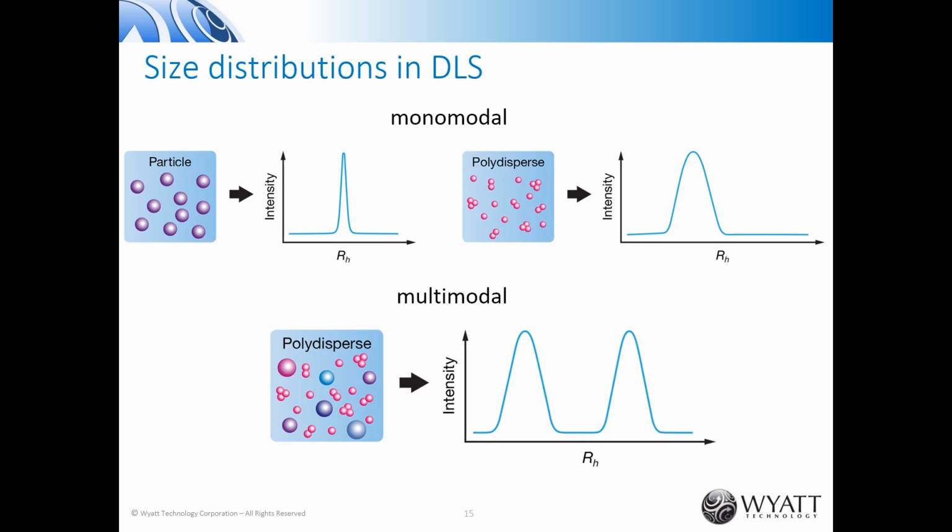On this slide, it demonstrates the utility of the hydrodynamic radius. So when you have a monodispersed particle size, your hydrodynamic radius will have a very narrow width. It'll be a nice tight peak. As you start to get dimers and trimers and more aggregates, you will end up with a more polydispersed sample, and the width of your hydrodynamic radius will start to get much larger.